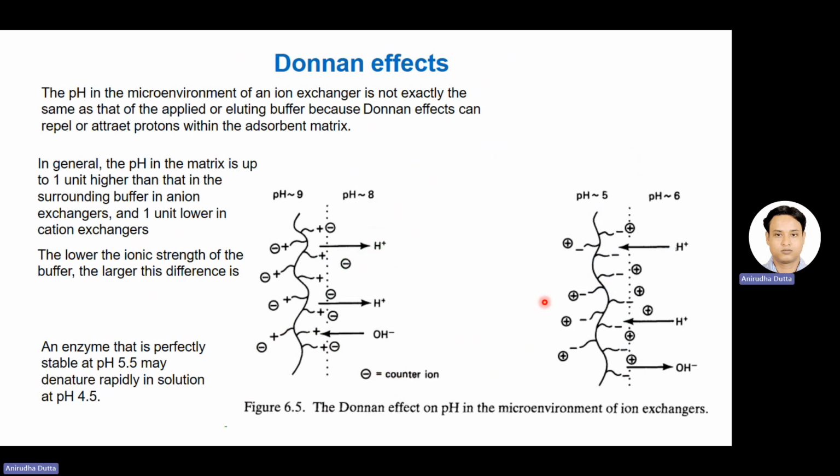So now we are going to discuss an effect called the Donnan effect.